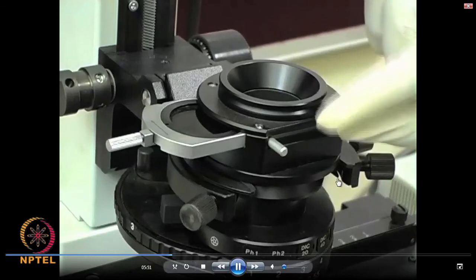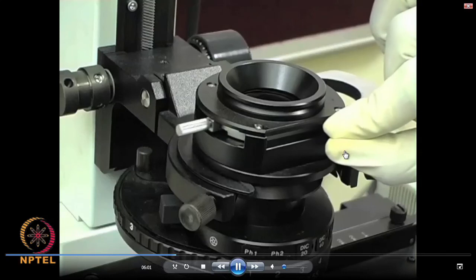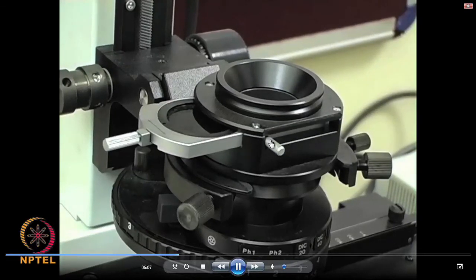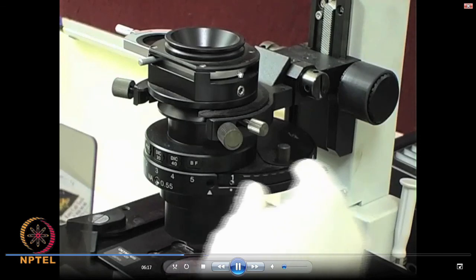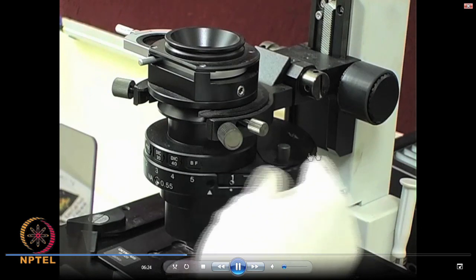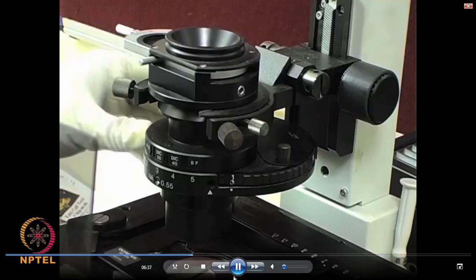I will describe the parts of this microscope so that you get familiar with the important things you need to understand. What is being shown here is a polarizer, and when you do not use the polarizing mode, it will be a slot for the bright field mode. You also have condenser aperture lenses, which have different slots. I will talk about it much more elaborately in the next class.